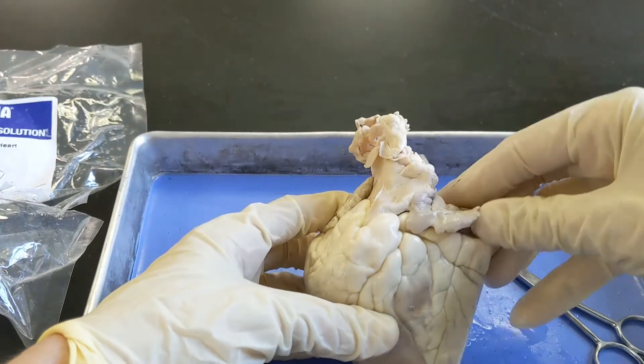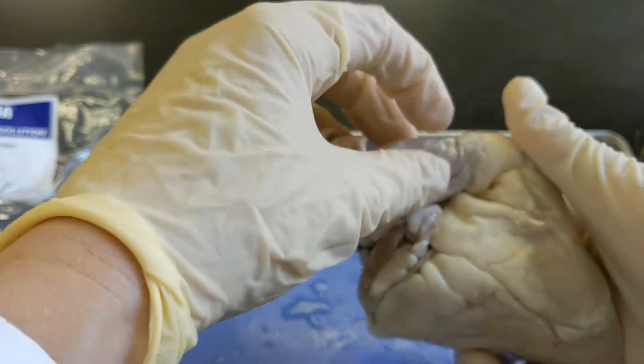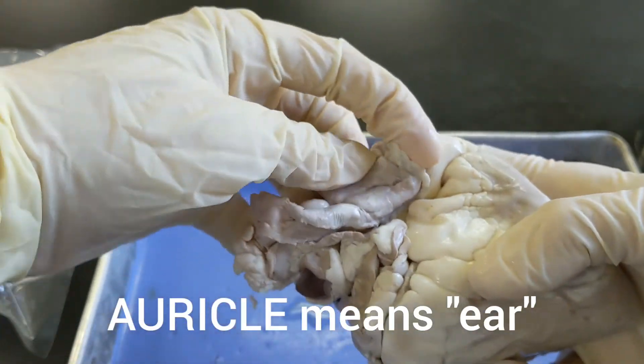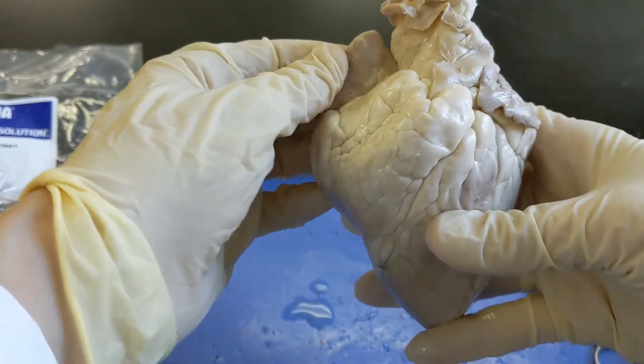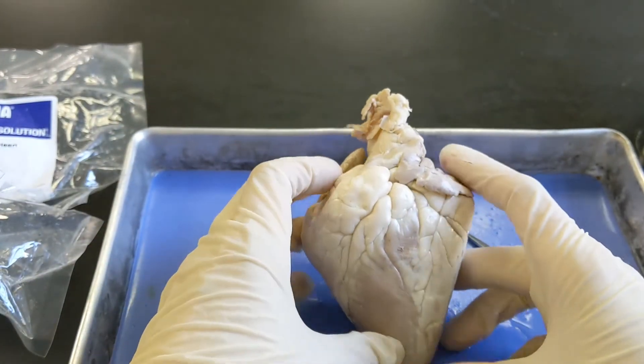Up here we have these flaps, and the flaps are called the auricles. Auricle comes from the Latin word for ear, because they're thought to look sort of like ears. The auricles lay atop the atria.